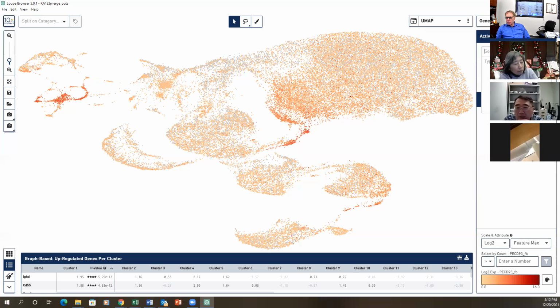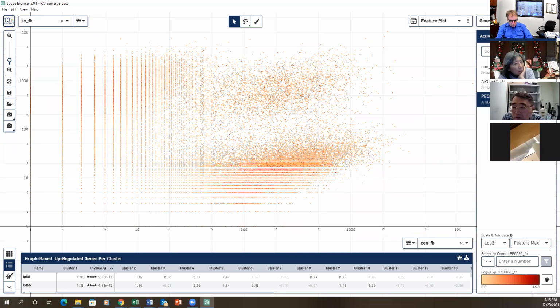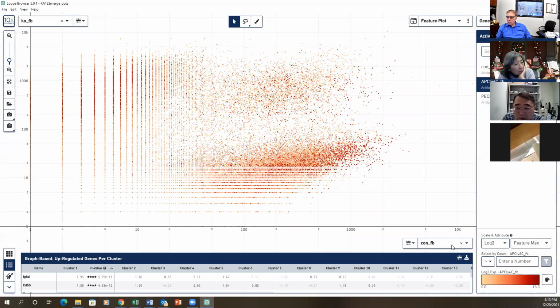You look at the other plot, the feature plot. Yes, you go back. Okay, you look at this file, it can give you better results. Then you change the X, Y axis to the name. Yes, change it to APC LY6C.